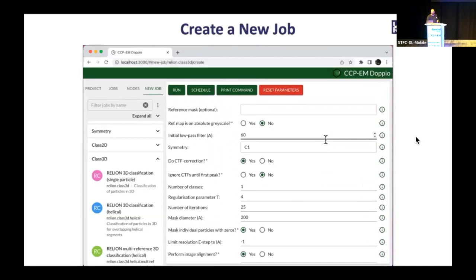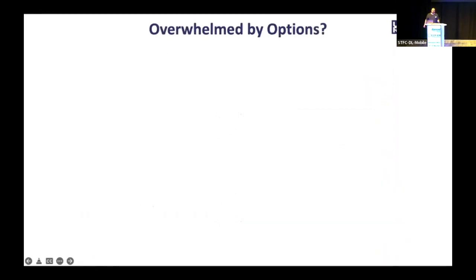So as you may imagine, when we have a full integrated pipeline going from start to finish, we're going to have a massive number of jobs and subjobs. And it's going to be really a lot to handle, having to sort through all of these to figure out exactly what tasks you want to run. And so the solution that we've built for this is a skin system.